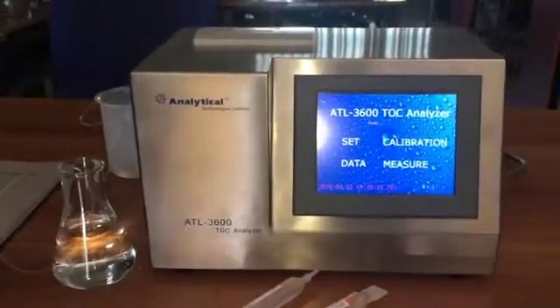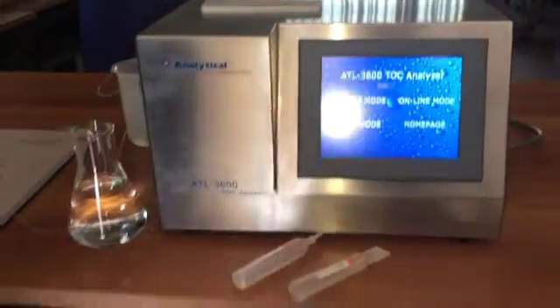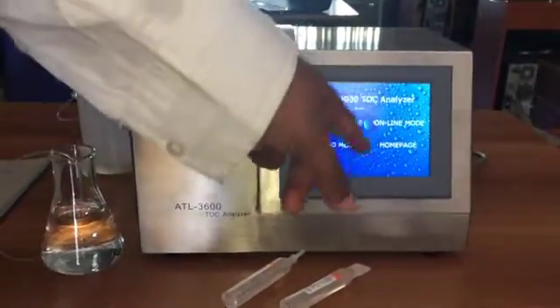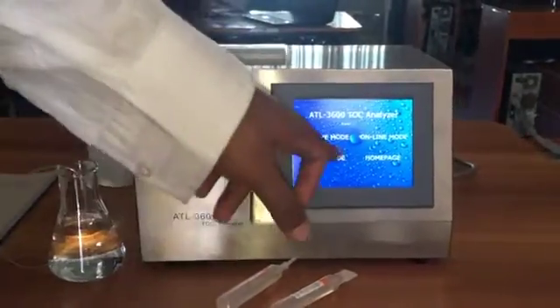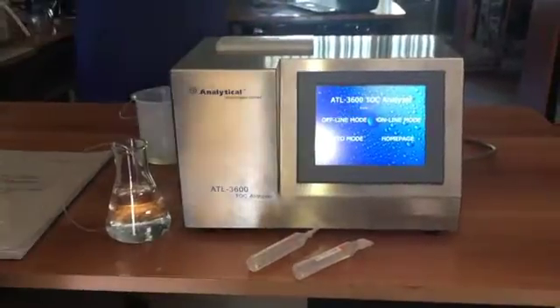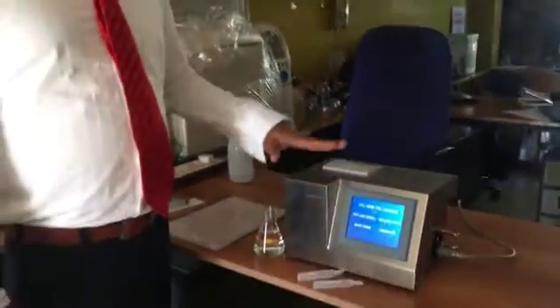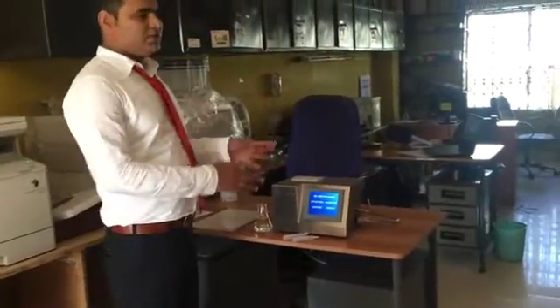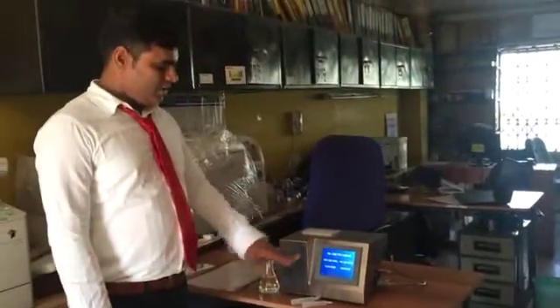To do a measurement of TOC you have to press Measure. In the Measure menu you again have four screens: one is Offline mode, Online mode, and Auto mode. This is a great feature of our TOC analyzer — the same unit can be used for online, offline, and automatic modes. No need to change any parameters or modules; this is completely automated for all modes.